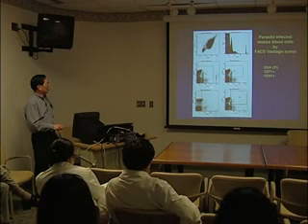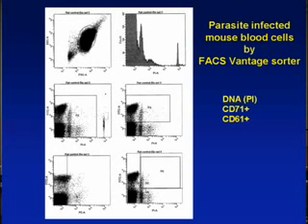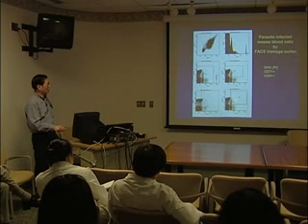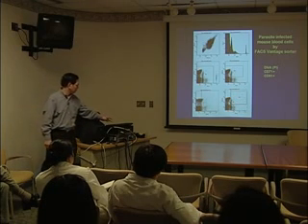And if you look for the expression of reticulocyte marker, you have a large number of reticulocytes. Also, you have the platelets, and we follow the same principle, that we only look at this group of cells, and we only look for cells with a positive reticulocyte marker. And finally, this is the group of cells where we want to look for the micronuclei, and this just shows you with the malaria-infected DNA that you're able to measure this type of cells.